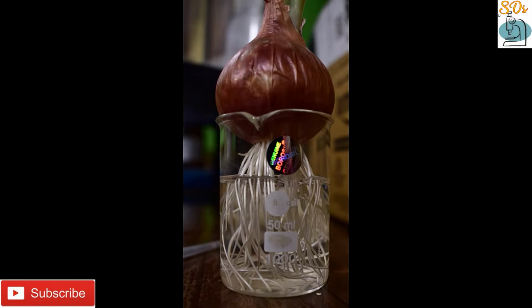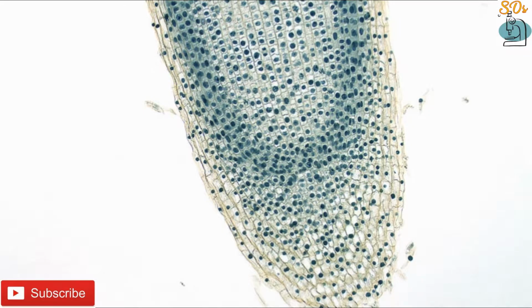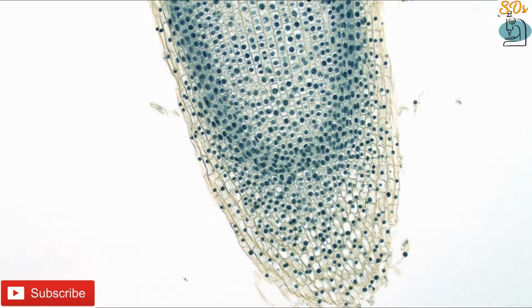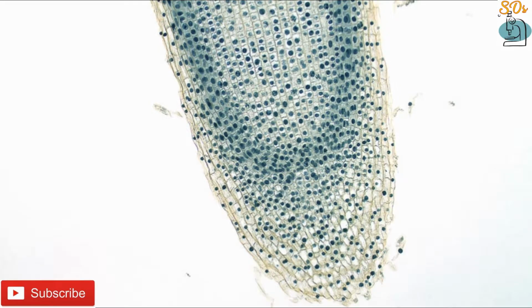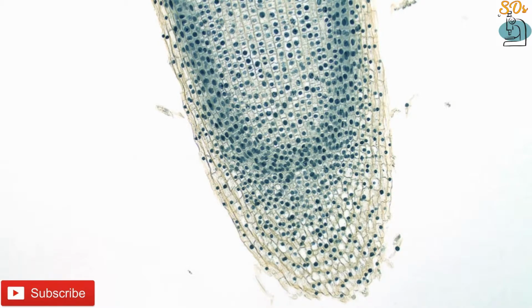Nowadays, this mitotic study is used in cancer, Alzheimer's and CNS disorder drug research. Study results can show changes such as anaphase bridges, breaks, lagging and stickiness, abnormal spiralation, multipolarity and polyploidy, and cytological aberrations, especially nuclear alteration, nuclear buds, fragmented nucleus and apoptotic bodies, cells without nucleus, binucleated and micronucleated cells. Morphological alterations in shape and size of cells, spindle disturbances and polar deviation in root tip meristematic cells.